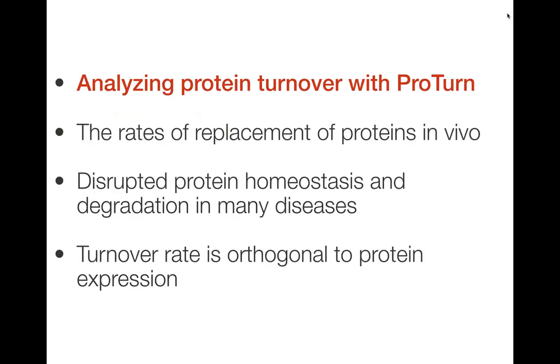So I guess I'll start with a little bit of background. ProTurn was designed to analyze protein turnover data from deuterium oxide or heavy water labeling experiments. Turnover rates are just the rates of natural replacement of proteins inside the cell based on continuous synthesis and degradation.